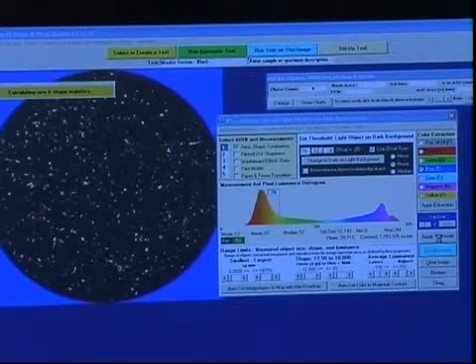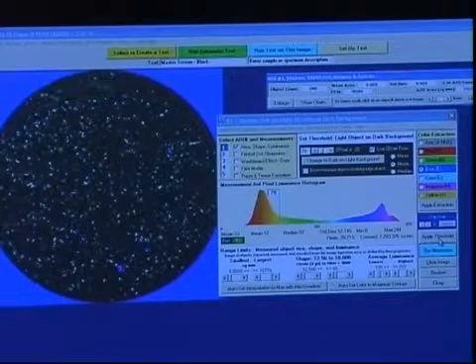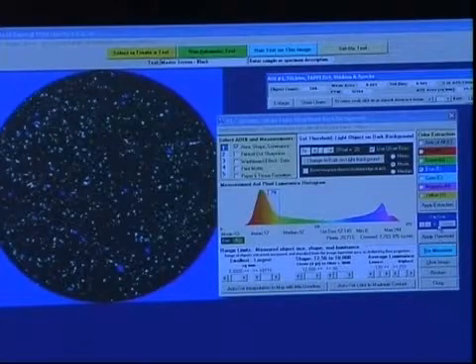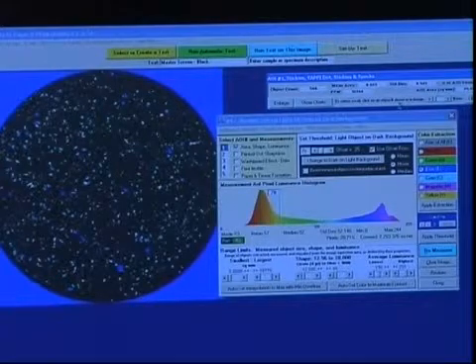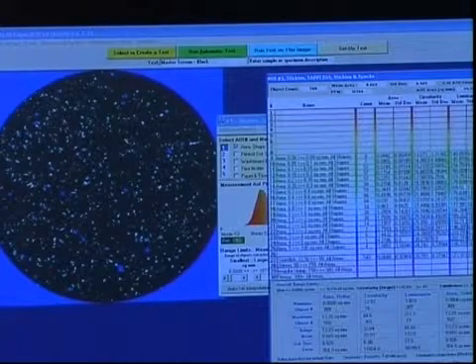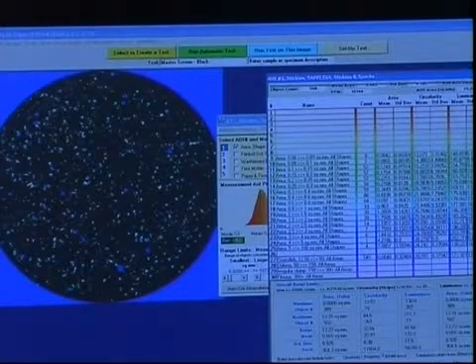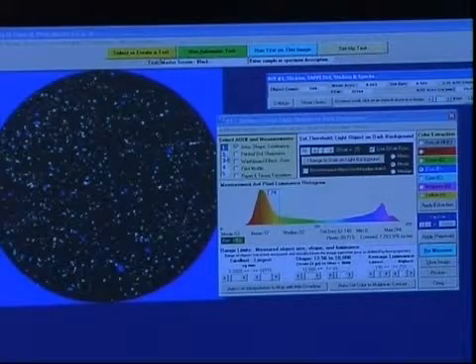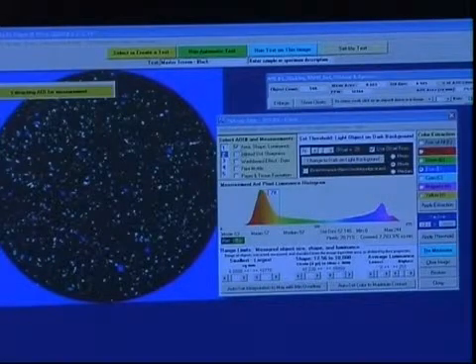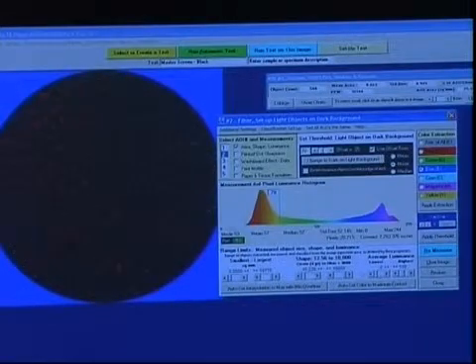But this is a big, busy image. It keeps the computer very busy, so it takes a while to calculate. We can pull this report down, and you have the same detail that you had on the dirt counter, but we're going to be able to do three of them. So we'll take the next AOI, and that is the fiber. And we'll do the same thing.